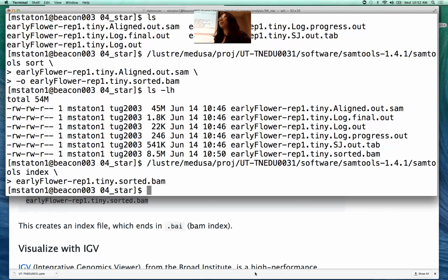What you're going to find with a lot of software packages in bioinformatics is there's an indexing step. You can think of that as just a way that the software is going to be able to freely operate on the data and then make your downstream analysis much faster. So this is very much a theme with read mapping, with BLAST, with viewing files. There's a lot of times an indexing step, and it's just doing some pre-computation to make things faster.